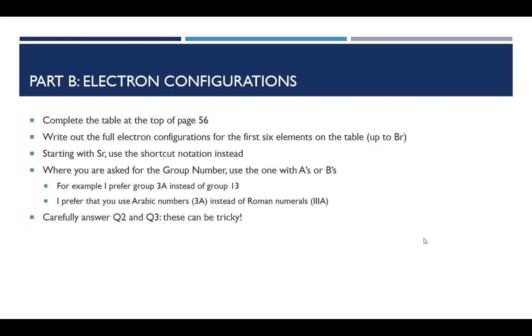Be very careful in answering question 2 and question 3. As I say there, those can be tricky, and that's kind of why we practiced a moment ago with that looking deeper section. A note, your lab manual uses the word sublevel instead of subshell. I've never seen that term sublevel used before. Subshell is the standard term, so if you want to change that from sublevel to subshell, please do so.